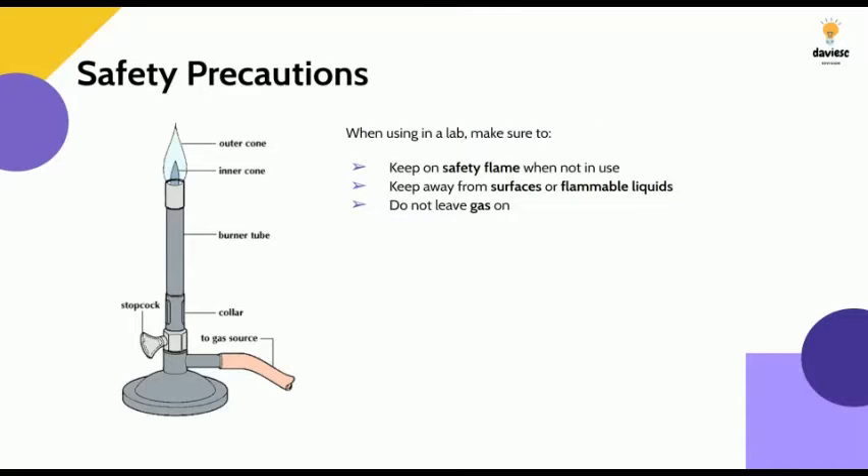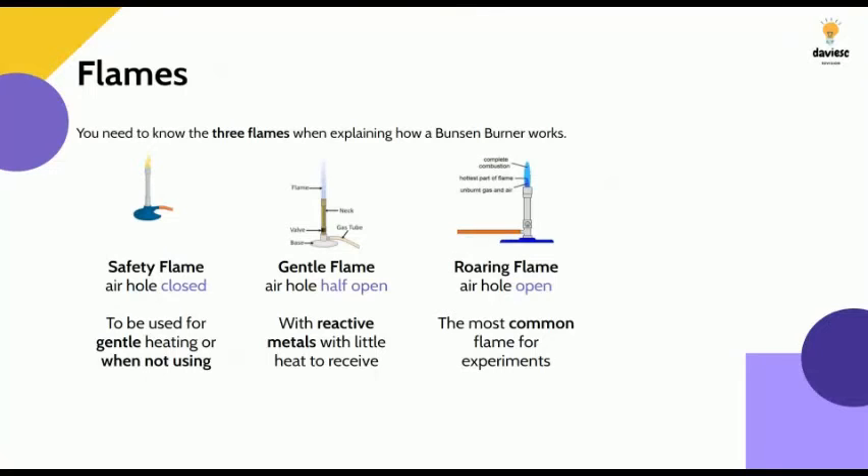Typical safety precautions you should know are: keeping the safety flame on when you're not using it, keeping it away from surfaces or flammable liquids, and not leaving the gas on when you're not using the Bunsen burner.